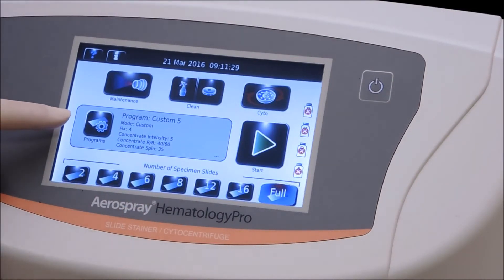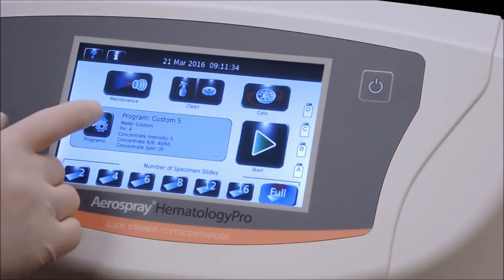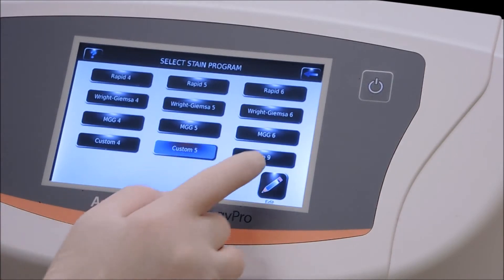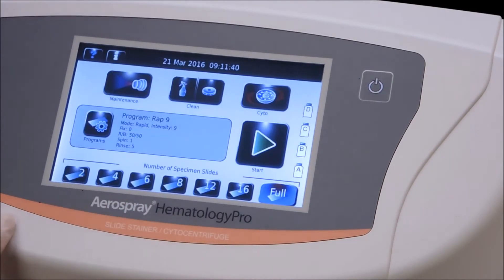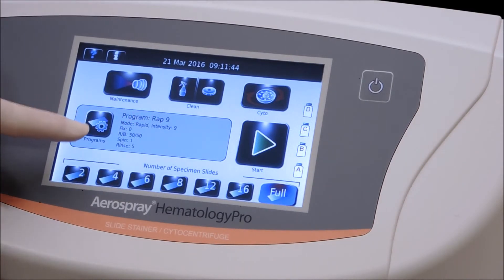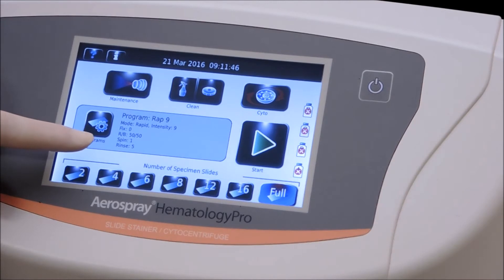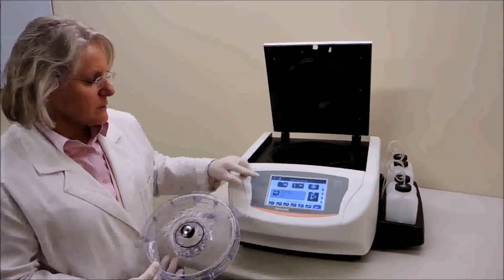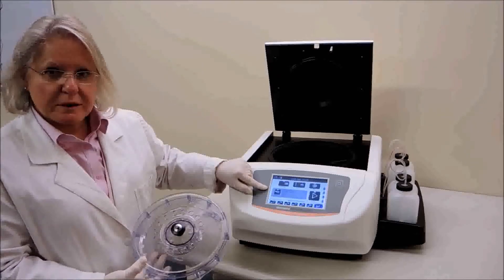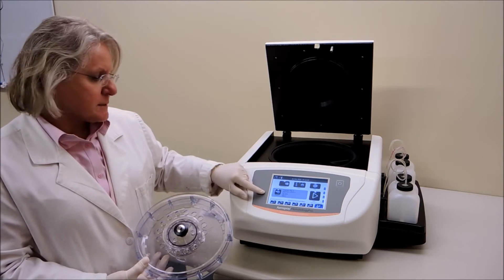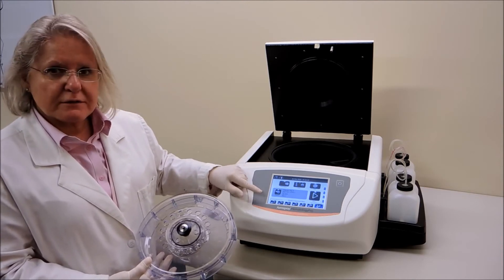Push the back arrow — you can see we have rapid nine, custom nine, and six is gone. Push the back arrow again. Now you have the program you had previously, which was custom number five that we started with. We go into our program and see that custom five is highlighted — we need to change to custom number nine. Now we have our custom number nine mode with fixation zero, 50/50, spin one, and rinse five.